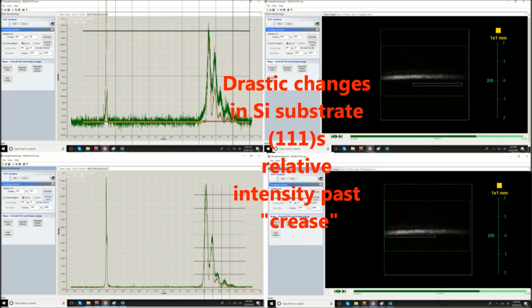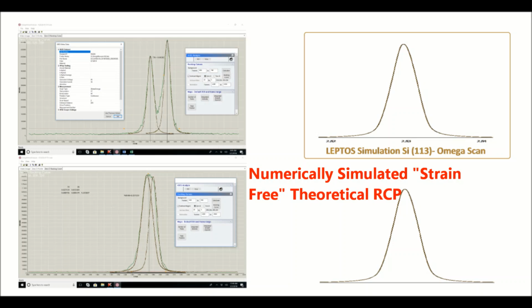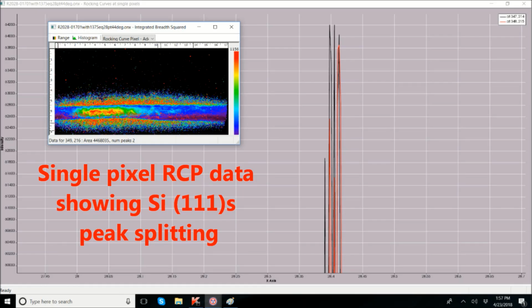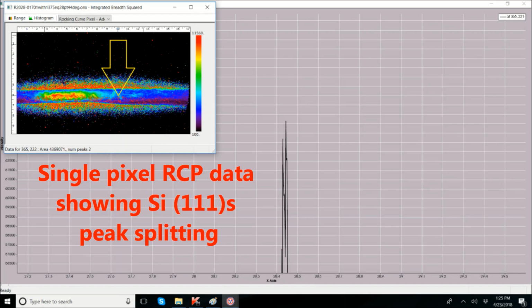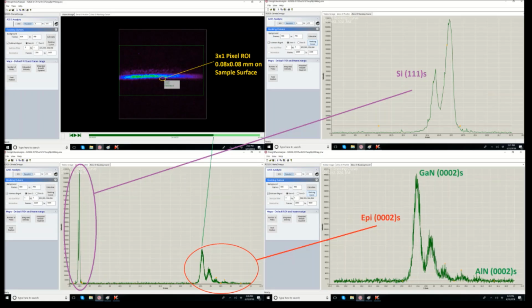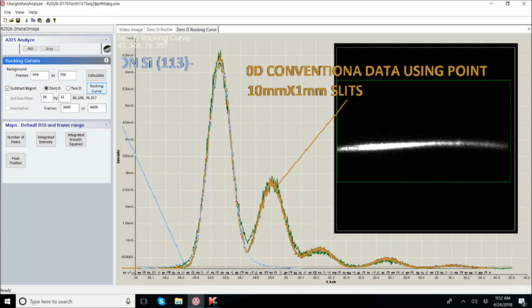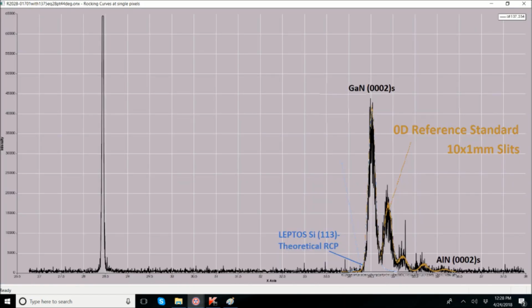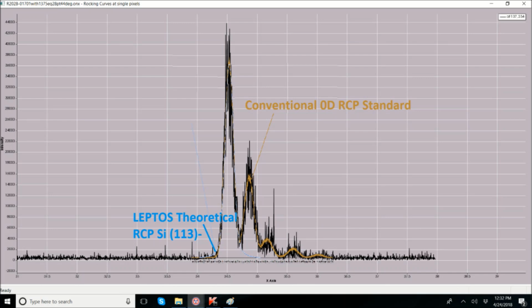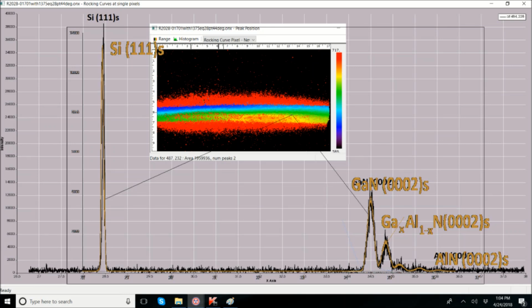There are many more nanostructural features to extract from this dataset with careful and more detailed analyses, including peak splitting, subgrain structure, epitaxial film thickness, layer composition, individual layer thickness, and defect density. It will also be possible to detect defect morphology once we are able to determine the correlation between nanostructure and XRD profile characteristics.